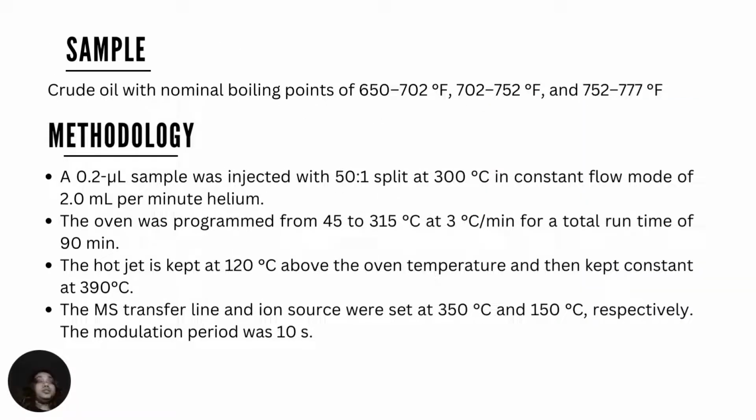The sample used in this article is crude oil with a few nominal boiling points. The first being 650 to 702 Fahrenheit, the second 702 to 752 Fahrenheit, and lastly 752 to 777 Fahrenheit.